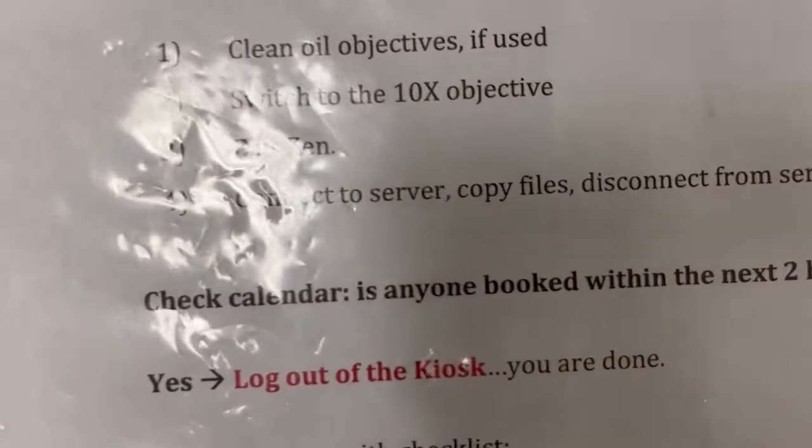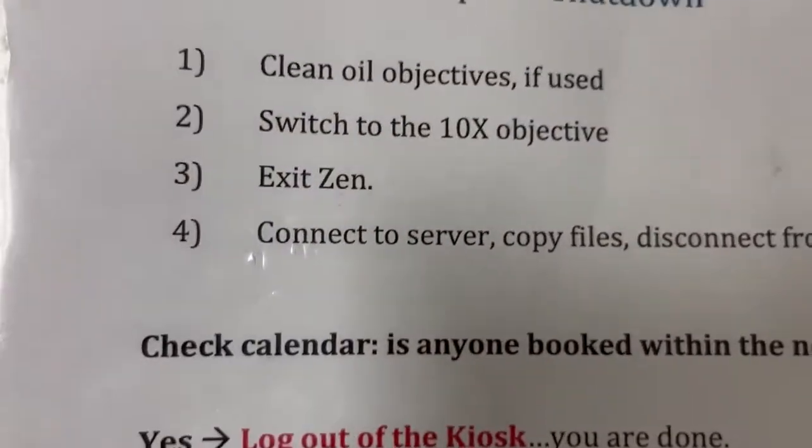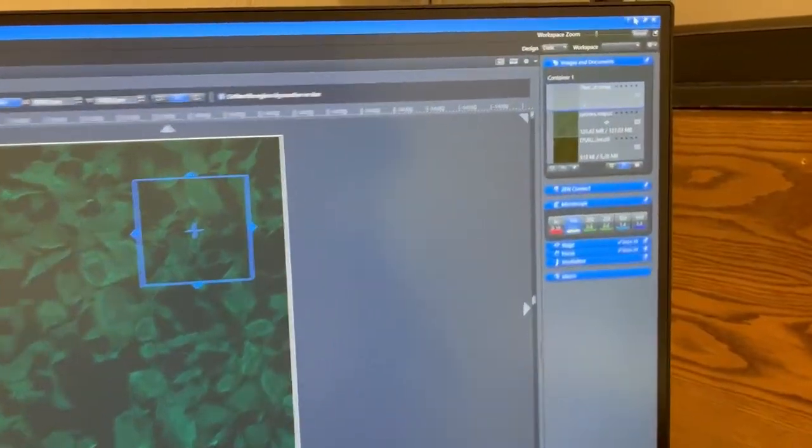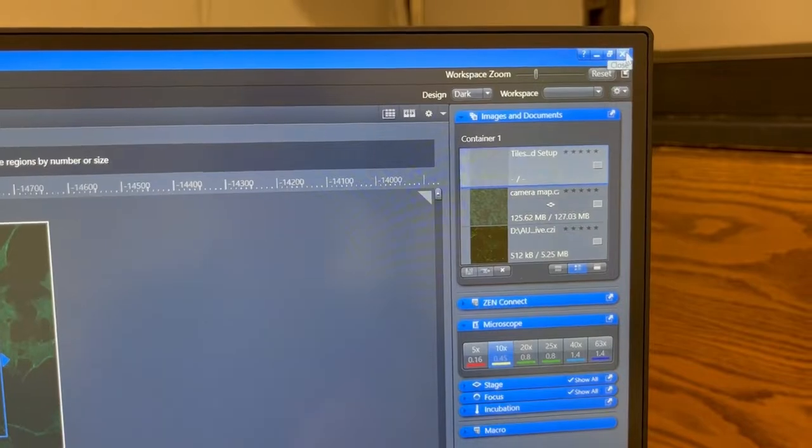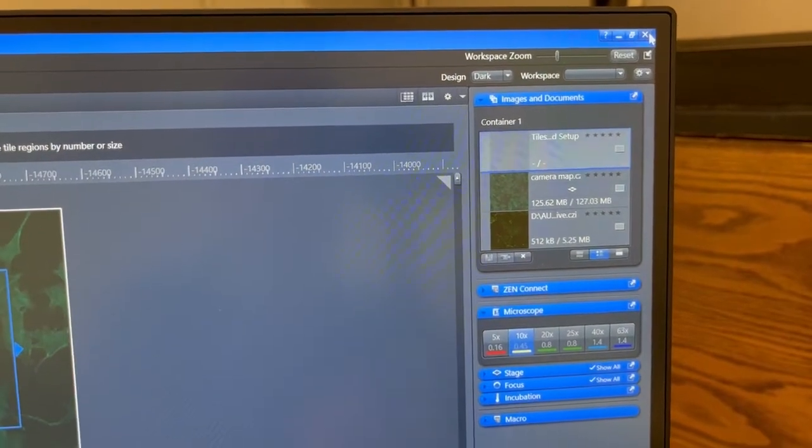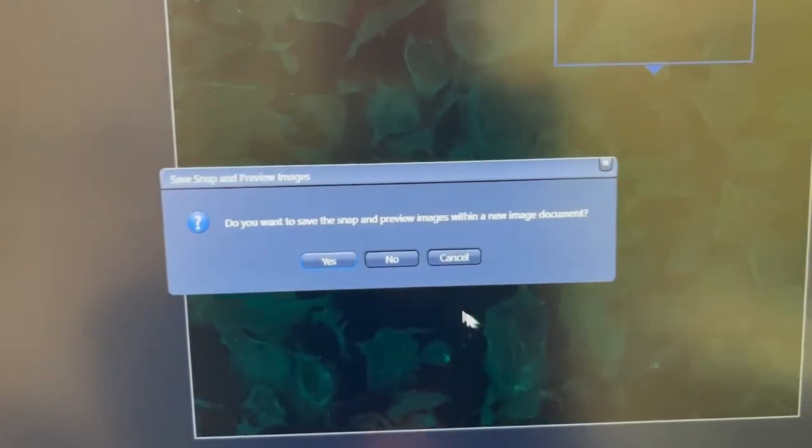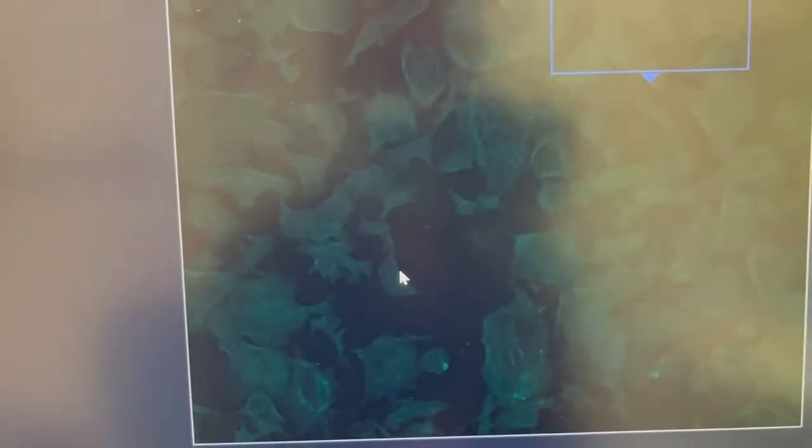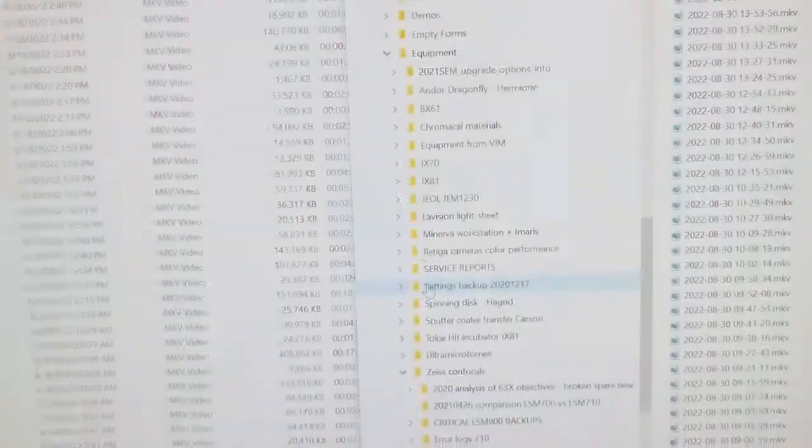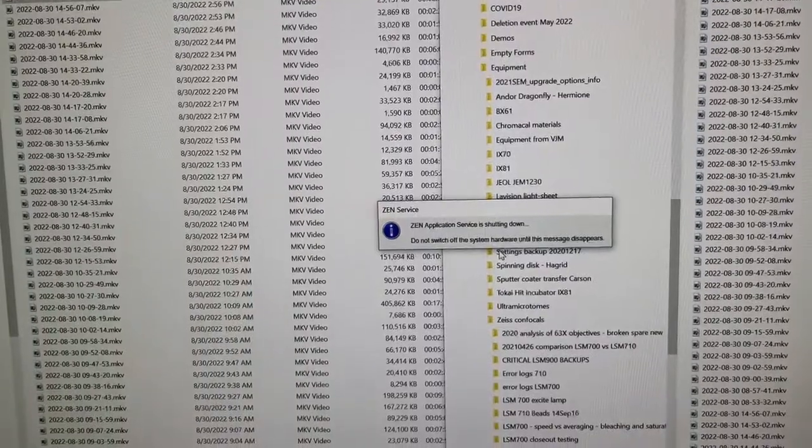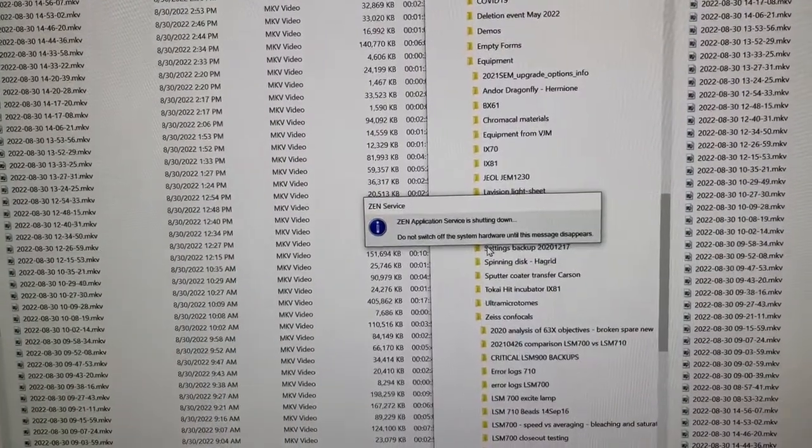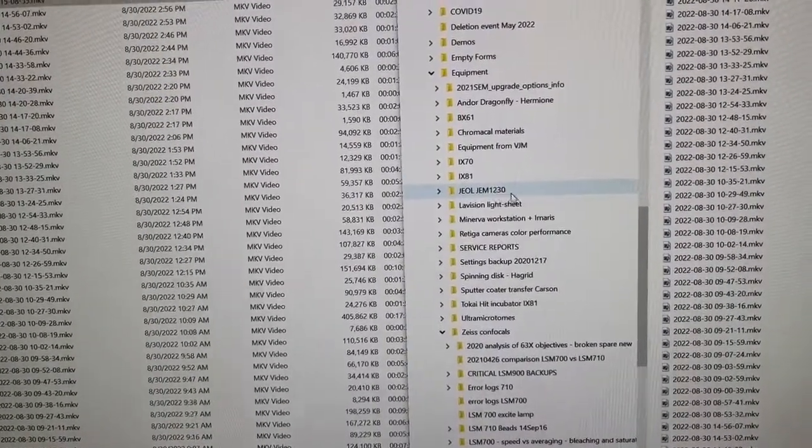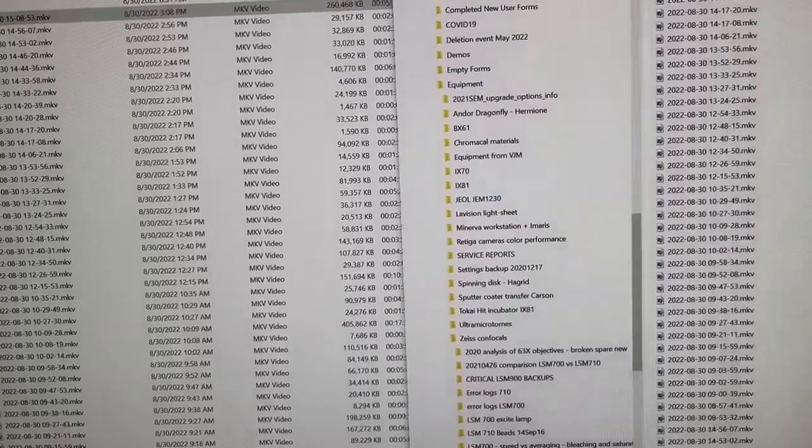The next step is to exit Zen, step number three. So we do that by X-ing out here at the top right and when we do that it will ask if we want to save the snap and preview images if we did any tiling and it will also typically ask if we have a lot of images whether we want to save them. You also saw here that there was a dialog box that said don't turn off the hardware until this dialog box disappears. So please pay attention and do that if you don't you'll screw things up for the next person.